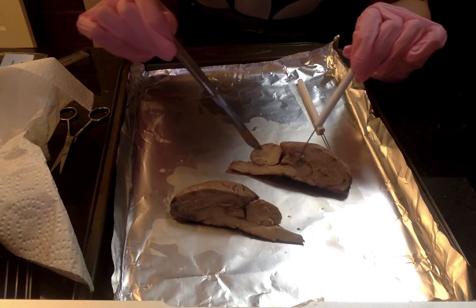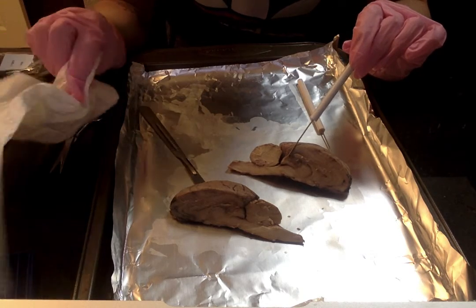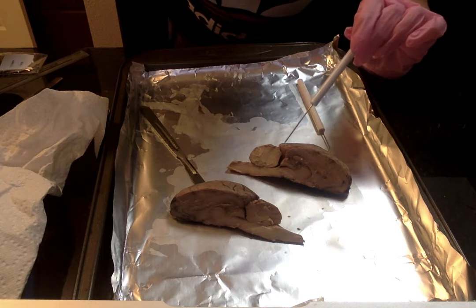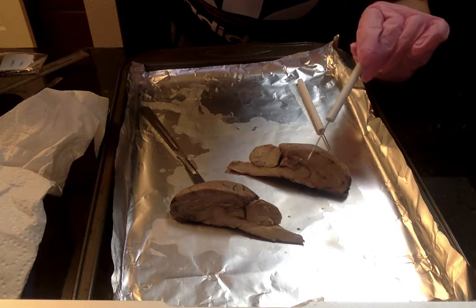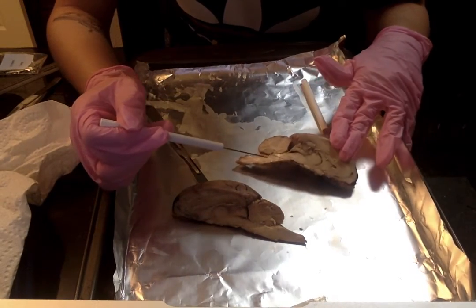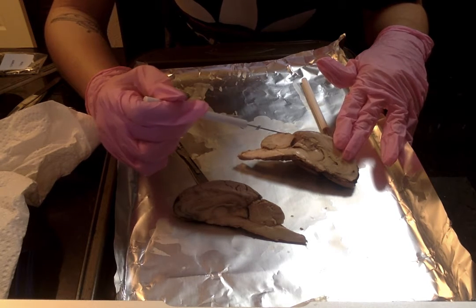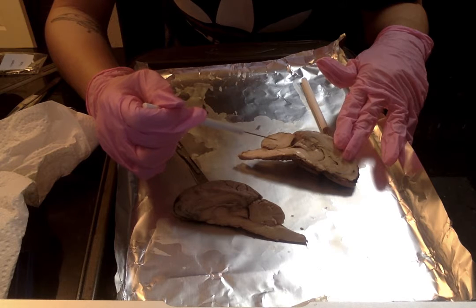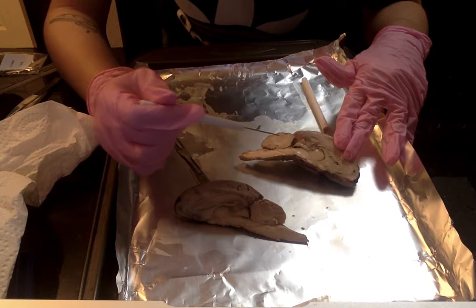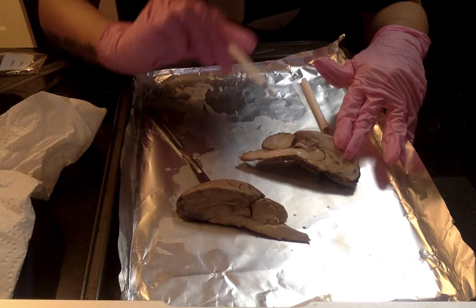Here we have the arbor vitae, and that is responsible for bringing sensory and motor information to and from the cerebellum. And if we look closer inside the cerebellum, then we see the branching of the lighter tissue surrounded by the darker tissue, and the branching is white matter, and white matter is made up of nerve axons, and the nerve axons primarily carry information.